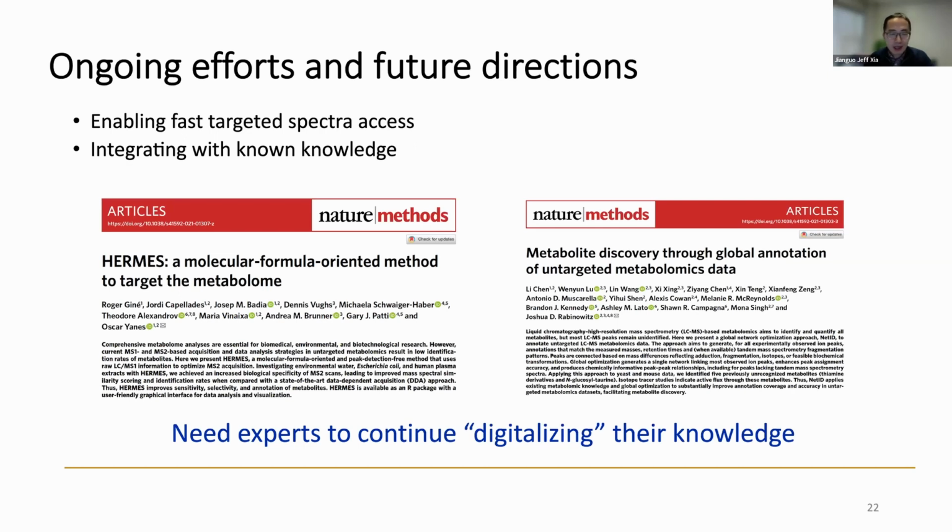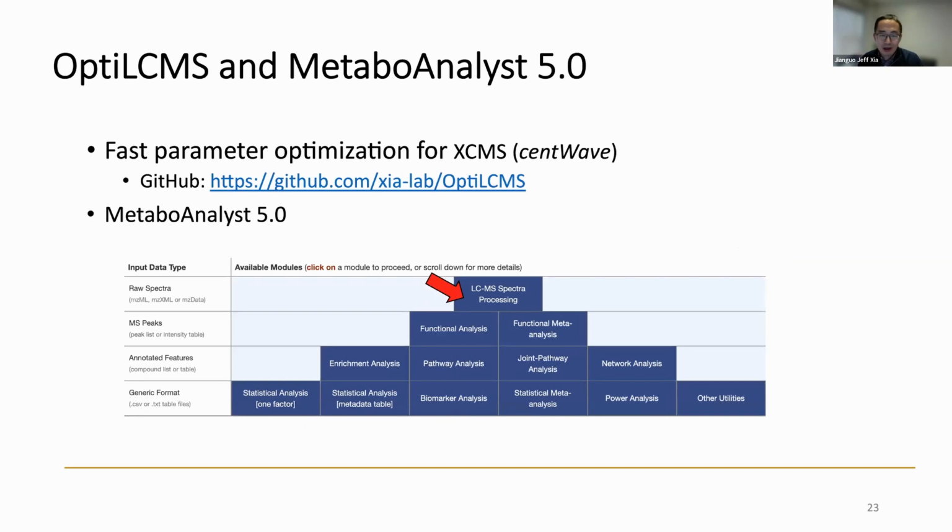So what I just described is the underlying concept of what we have done. But for general users, you need to use the web-based tools. And if you want to use our package, it is OptiLCMS on GitHub. It's under active development, because we want to continue benchmarking and improving it.